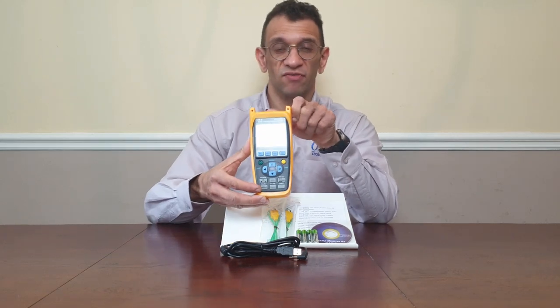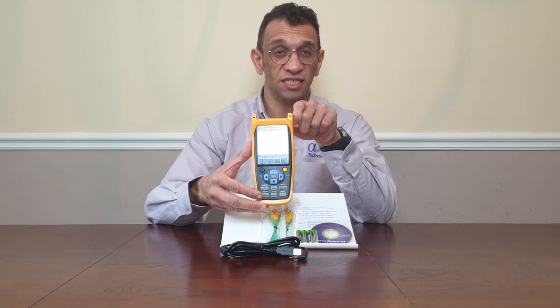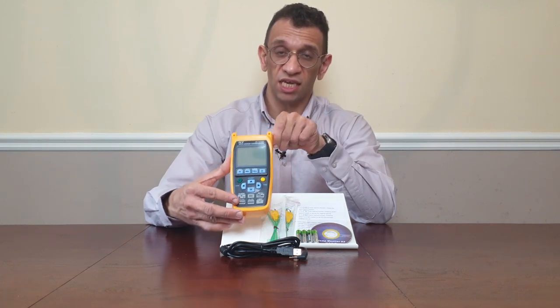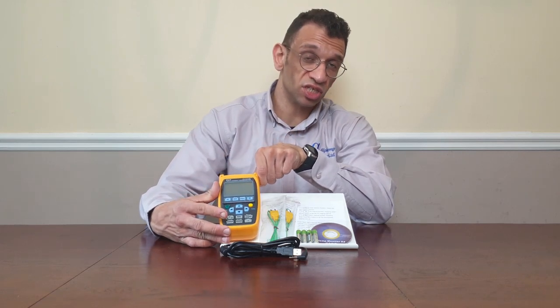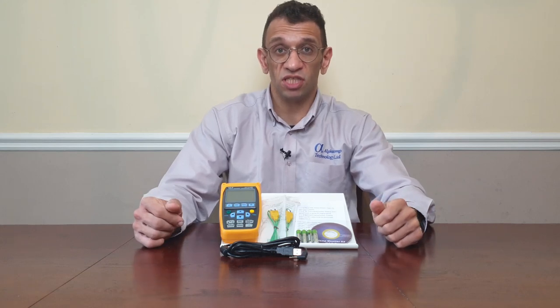The YCT747 is a portable and flexible temperature data logger. It can accept inputs from up to four miniature thermocouples of all types, giving you a potential temperature range of minus 100 to 1700 degrees Celsius using the appropriate probe. It can sample between intervals of once every second to nearly once every hour, and has a large multifunctional four digit display.